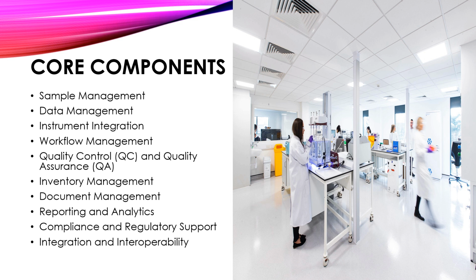Integration and interoperability. A laboratory management system integrates with other laboratory information systems, electronic health record (EHR) systems, billing systems, and external databases to enable seamless data exchange and interoperability across healthcare organizations.